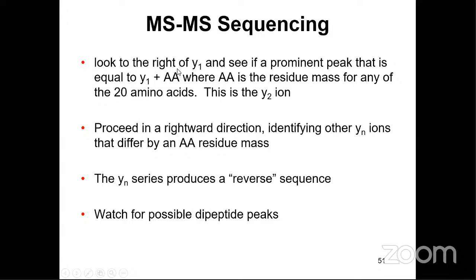one of those 20 amino acids and see whether there is any peak corresponding to that. If you get that, then you know that particular amino acid is the next one present, and then so on. That way you build up Y1 to YN, and then you do the reverse from YN for all the Bs. So that is how you try to sequence.